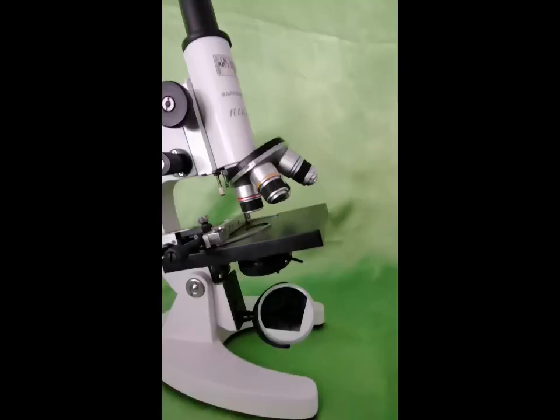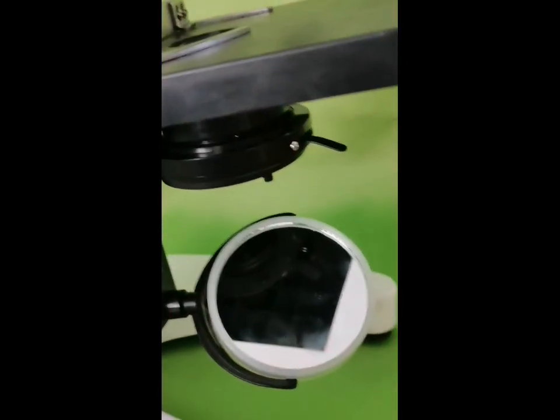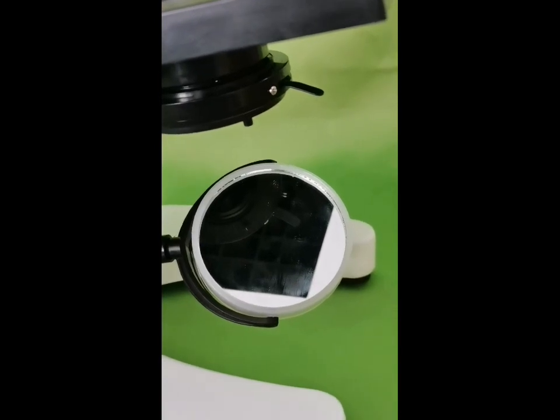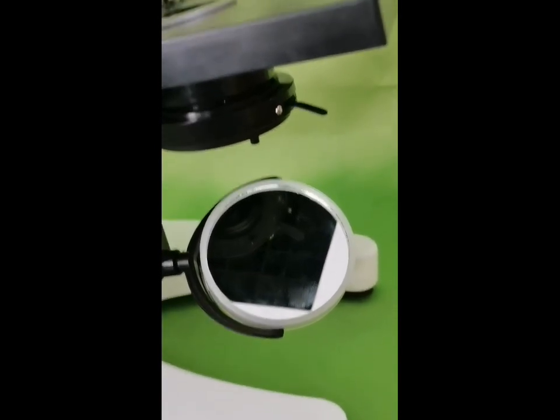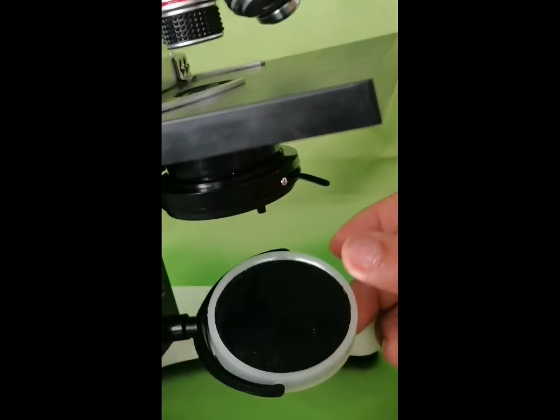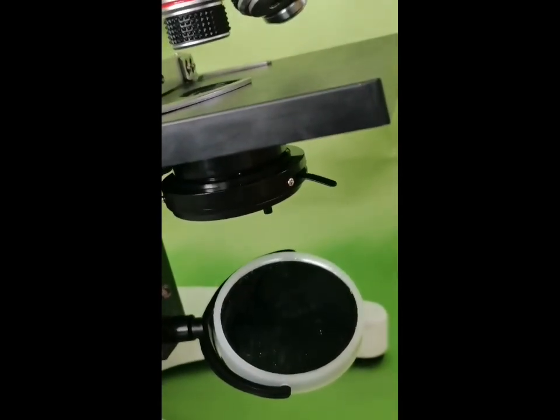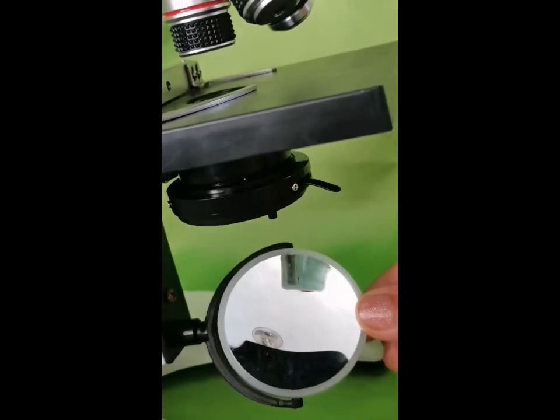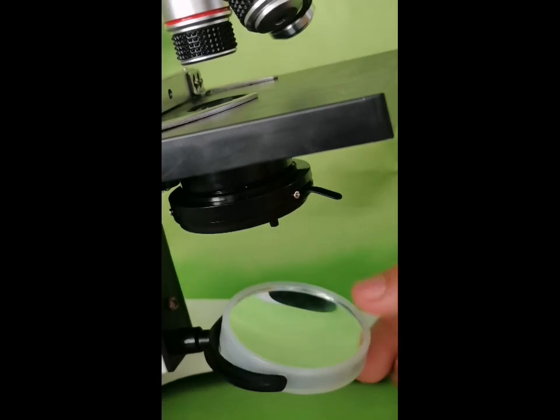Now, let's take a look at the illuminating parts, which include the mirror. The mirror is an adjustable part held by the mirror fork. It is flat on one side and concave on the other side. It is used for collecting and reflecting light through the object, lenses, and into the eye.